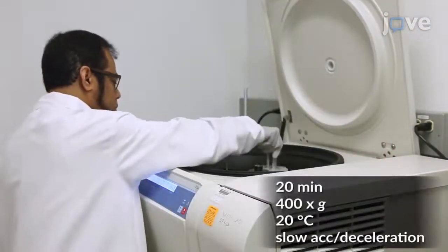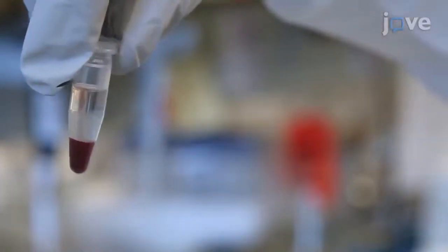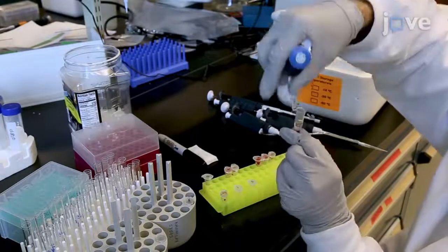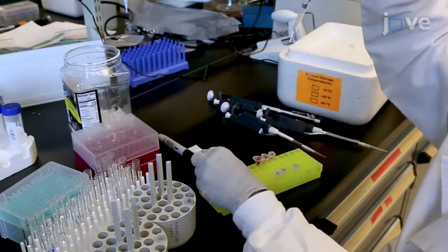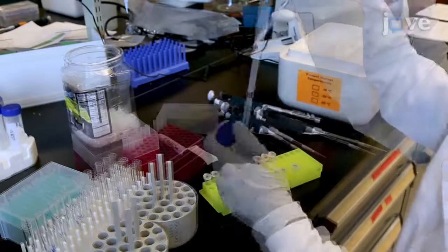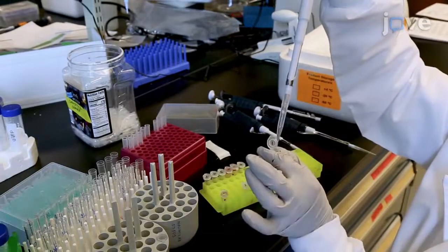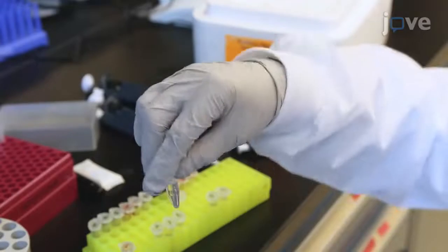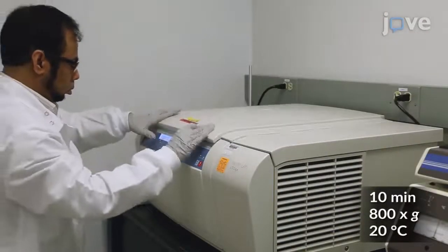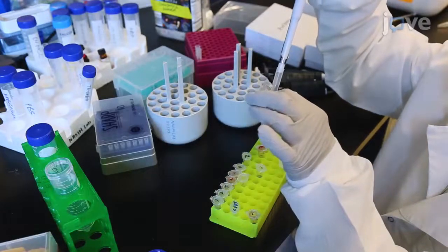After centrifugation in a swinging bucket rotor to isolate the platelets, use a new wide-bore pipette tip to collect most of the platelet-rich layer and a small fraction of the platelet-poor layer without aspirating the white blood cell or red blood cell layer. Add the platelet sample to a new tube with 1 mL of PBS. Mix by inversion before performing another centrifugation, then re-suspend the pellet in 200 uL of PBS with mild pipetting.